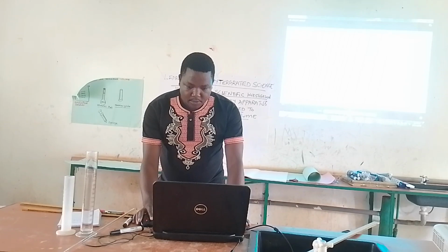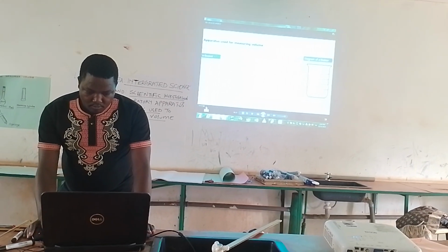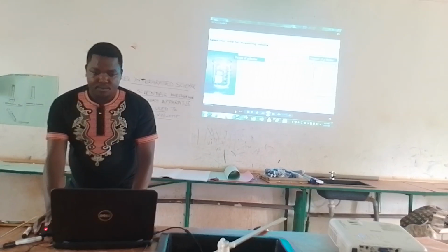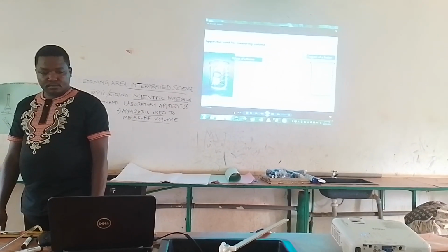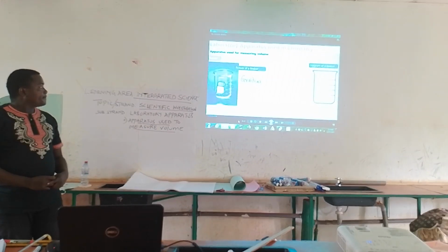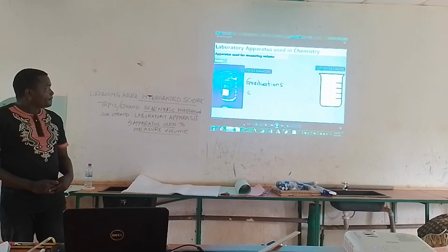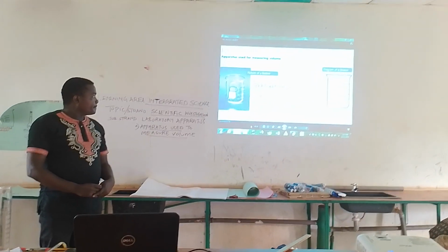Used for measuring volume. The first category, on the left you can see that it has got markings, which we usually call graduations, or sometimes you can call them calibrations.